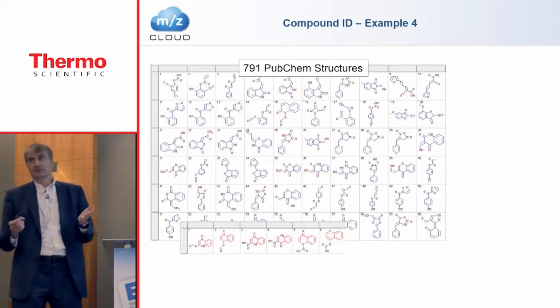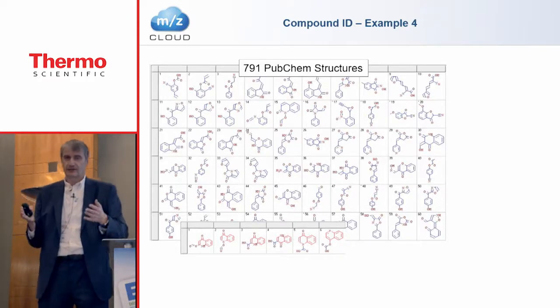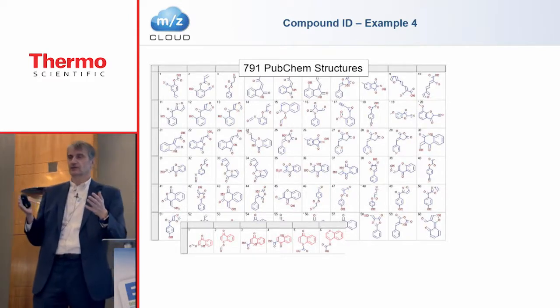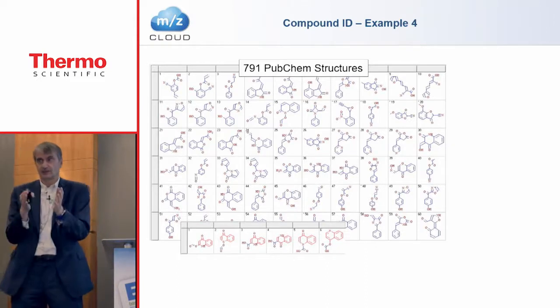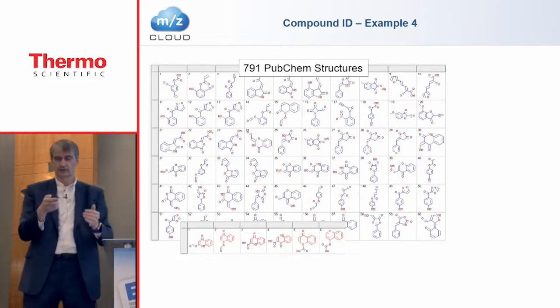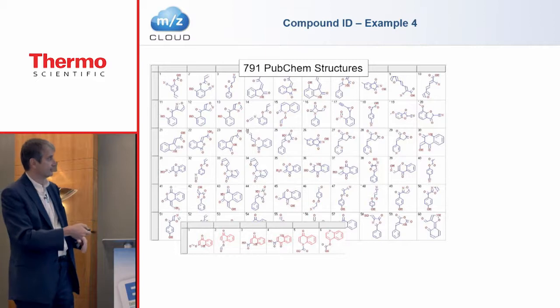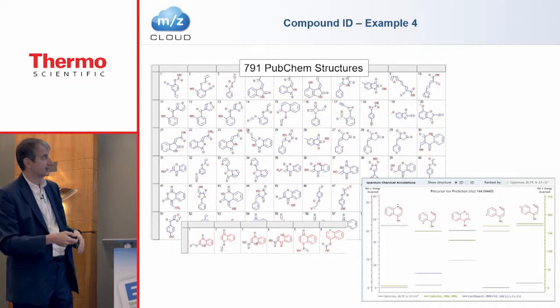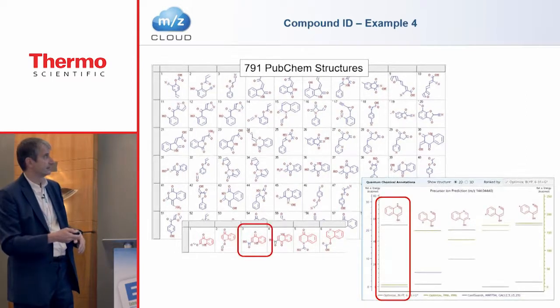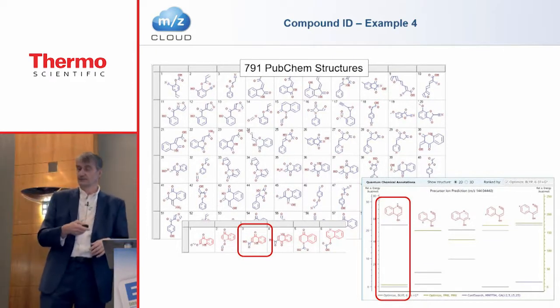Well, the typical experiment in mass spectrometry is you have an m/z value, you search in a structural database, and you would like to restrict all these candidates to one or a limited number of them. Using precursor ion fingerprinting, we identified those compounds, and if we have high quality fragments like this one, calculated quantum chemically, we can with certain probability say this is this one.